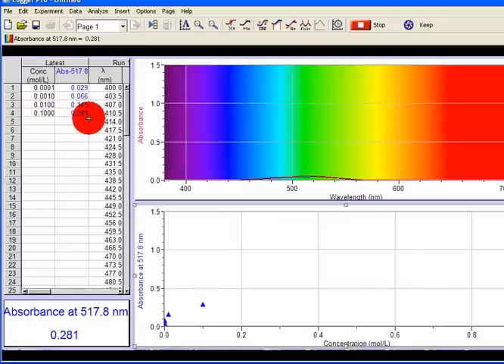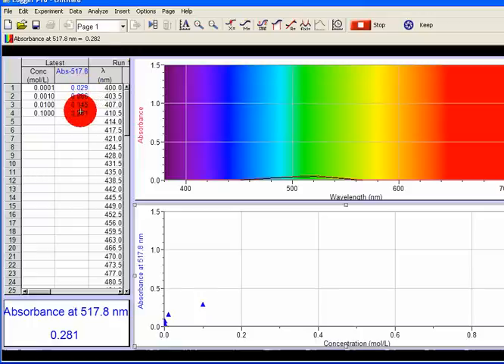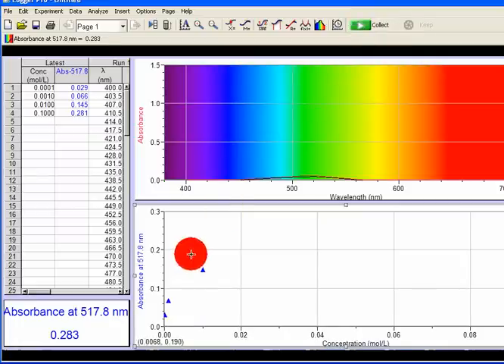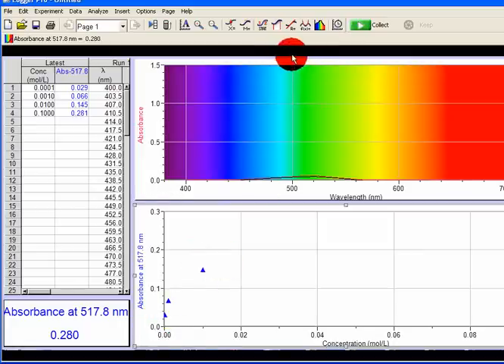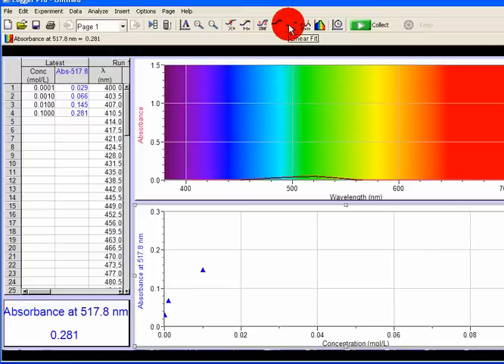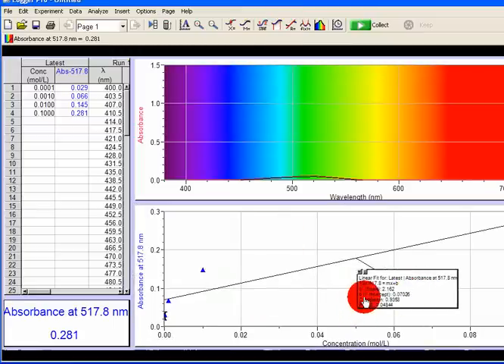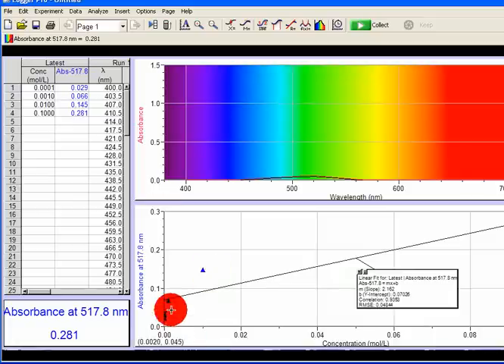So I have 4 data points. I'm going to click on Stop — stopped my data collection. What I have now is a standard calibration curve. I get into Linear Regression or Regression Analysis. So what I can do now is auto-scale this range. I press A to auto-scale. So click here — auto-scale — make it bigger. This is my standard calibration curve.